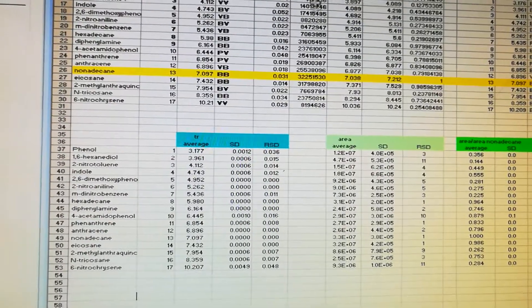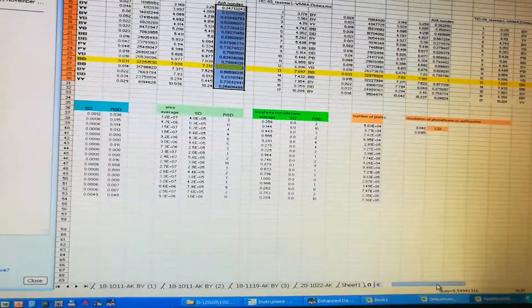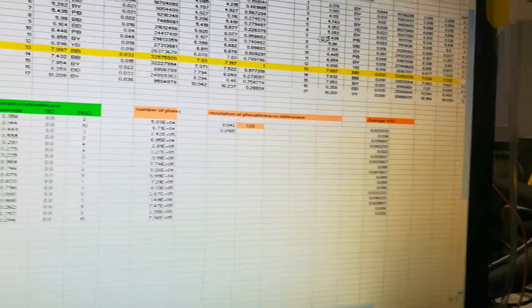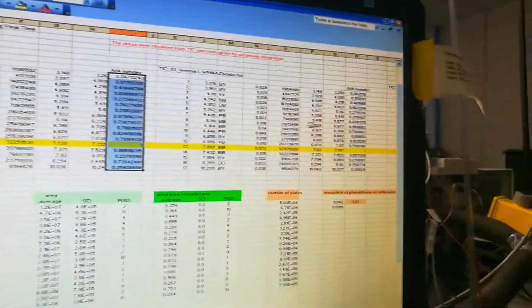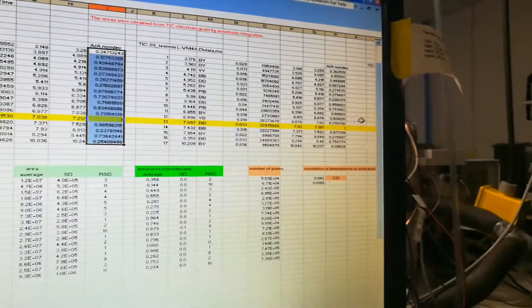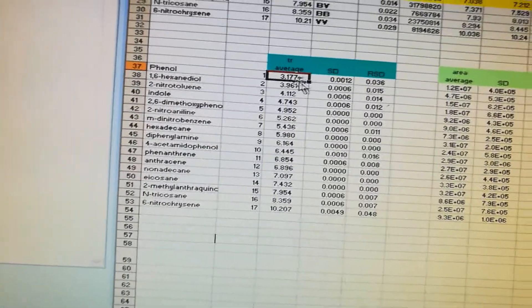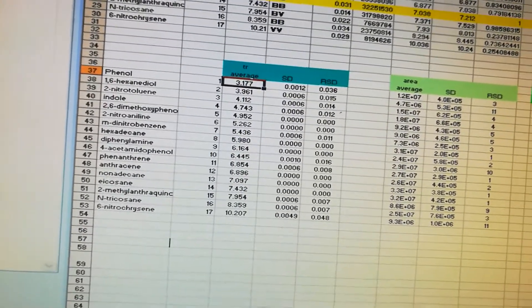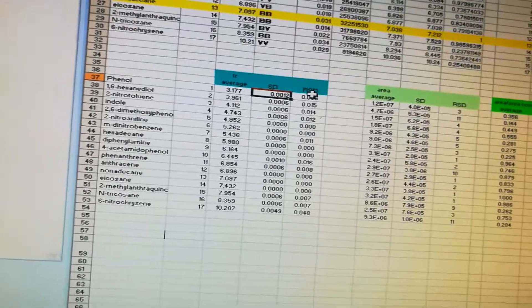We take the ratio of each peak's area over the area of the internal standard, nonadecane — that gives you this column. We had three test mixes to work with: test mix five, three, and four. The steps we follow for all three tables are the same, so once the first table is done you should be able to complete the other two from the other ChemStation files. Then we have the averages: retention time averages for all three trials across all 17 compounds, standard deviation, and relative standard deviation (RSD).